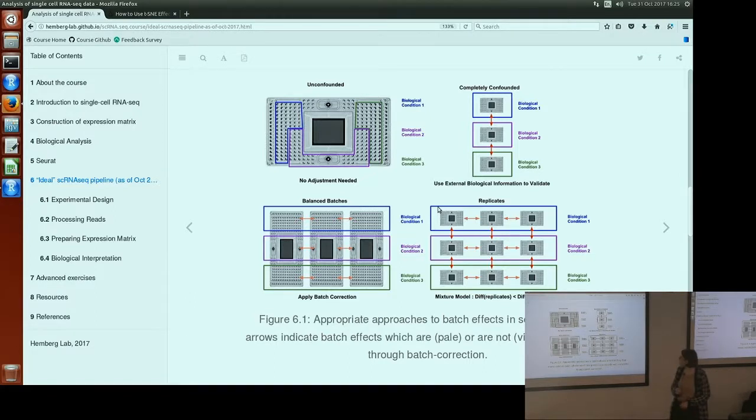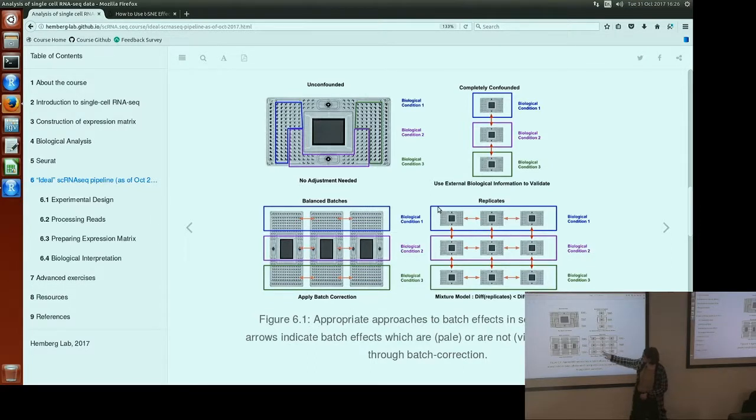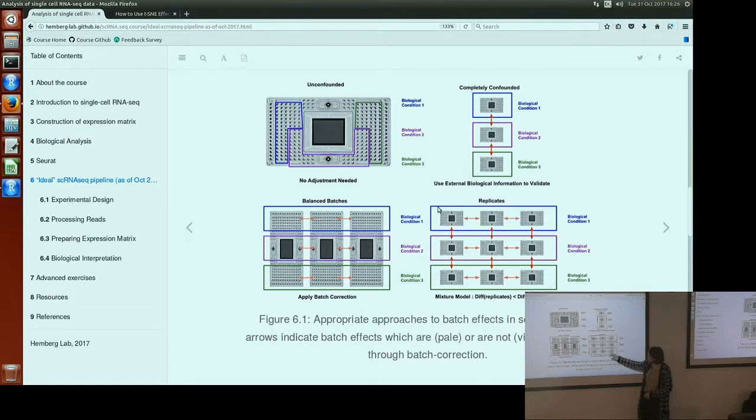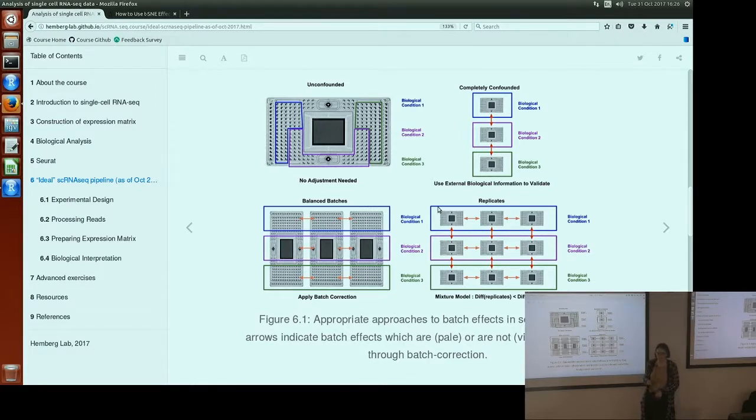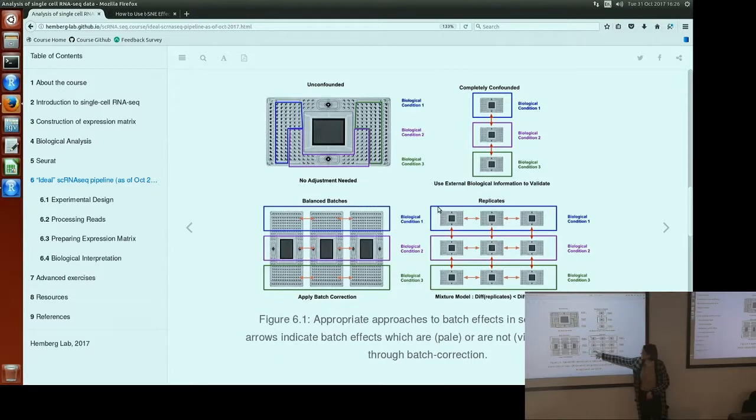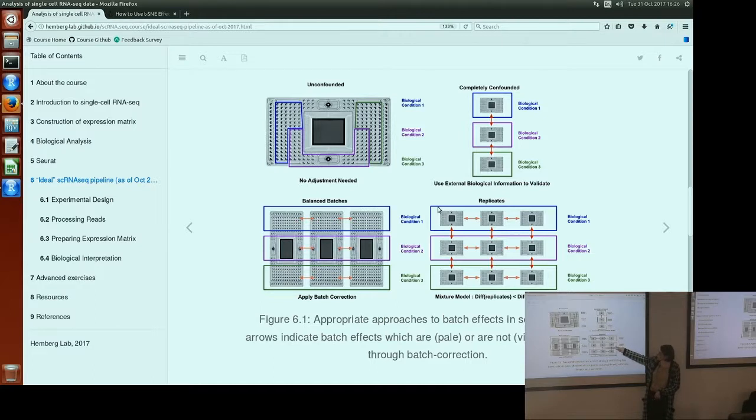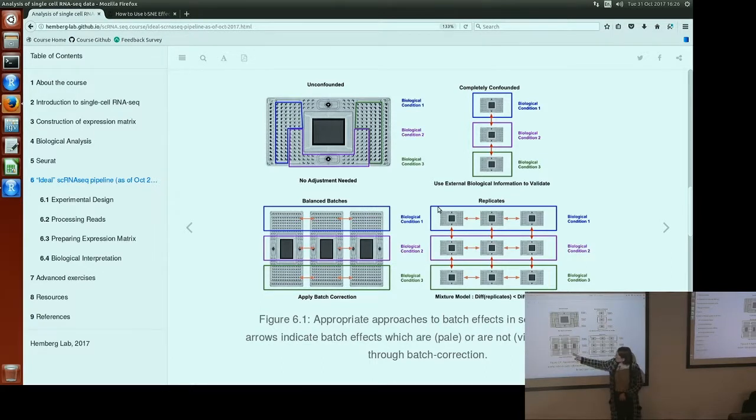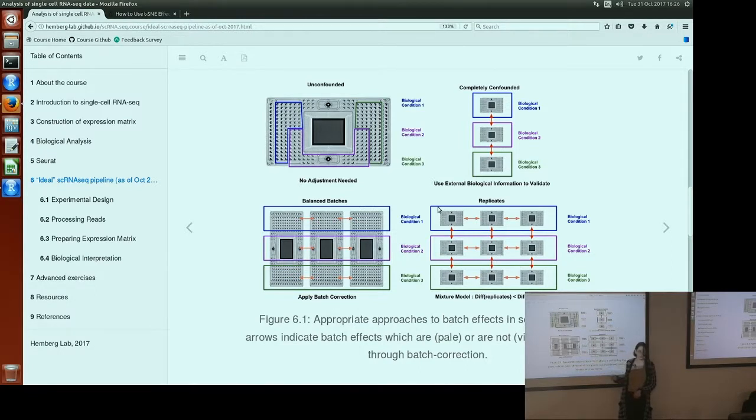This Tung data falls into this case with the replicates. We have three individuals and three replicates for each individual. We have batch effects between every different pair of each possible batch here. So we have batch effects within each individual and also batch effects between individuals. With batch effect correction methods, we can only correct for these batch effects within individuals and can't correct for the batch effects between individuals because they're confounded with our biological factor of interest. If we had a balanced design, then all the batch effects are just between these batches, not between our individuals, and we can correct for all the batch effects using batch effect correction.